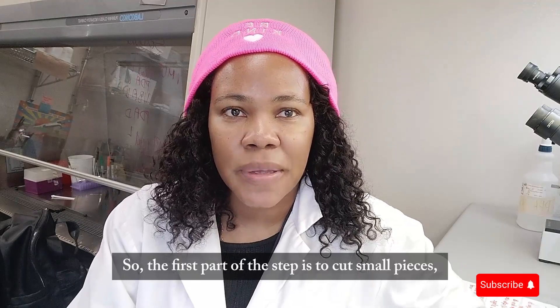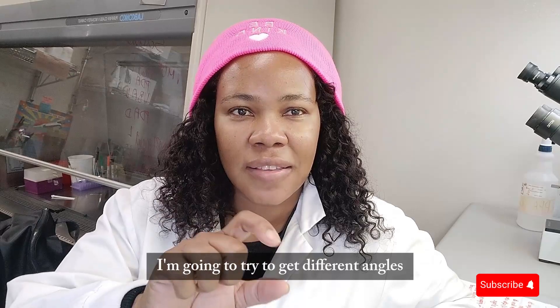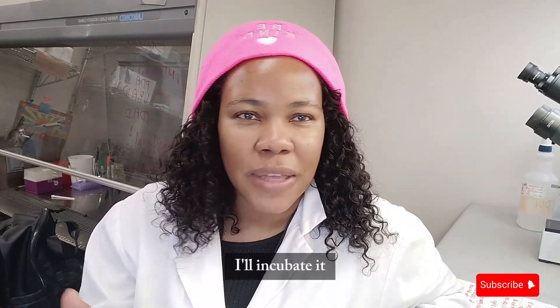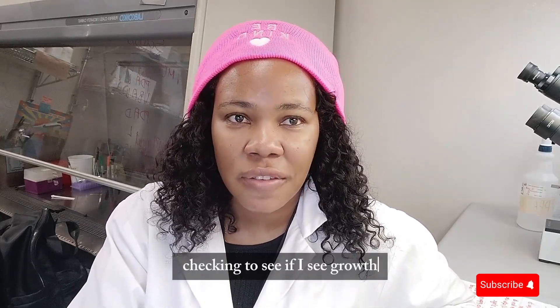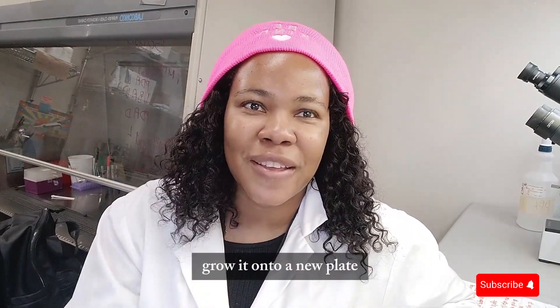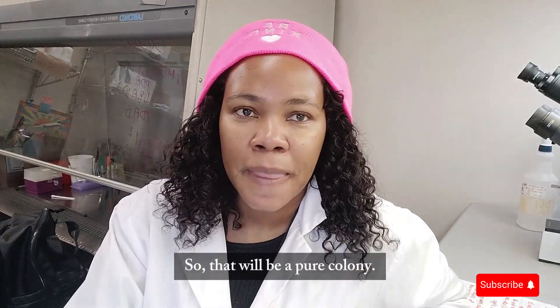The first part of the step is to cut small pieces, put them on the plates, and incubate. I'm going to try to get different angles touching different surfaces of the plate, because sometimes the microbe or fungus is in the little crevices of the sample. I'll incubate it in the dark for maybe three to five days, checking for growth, then repeatedly transfer a piece of the colony onto a new plate until I only have one colony growing.